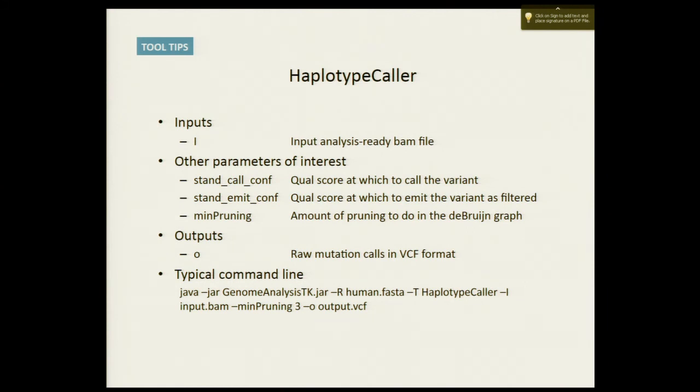So you had to have seen it with 3 or more reads essentially in your graph to keep it. As you increase that value, you're pruning away some of the paths and you reduce the runtime. You lose some sensitivity by doing that, but you gain in lost runtime. So what's the default value? The default value for the pruning is actually very conservative. The default value is 1, so as to not miss anything.